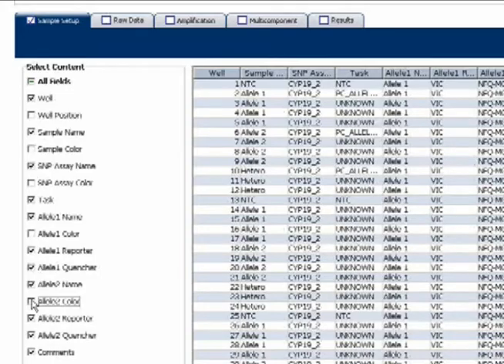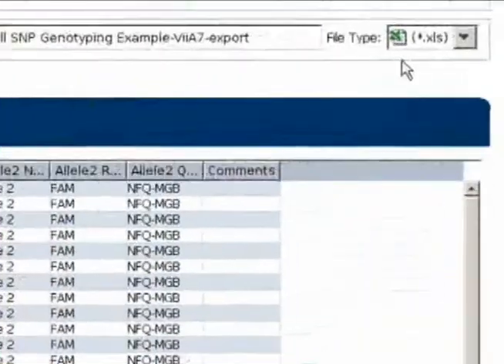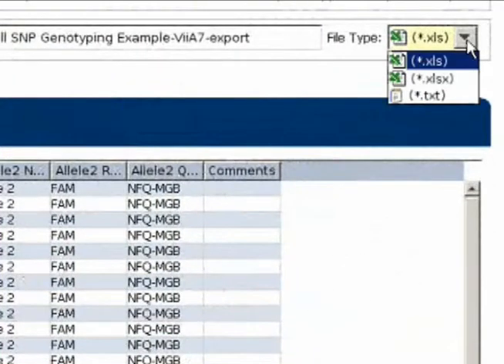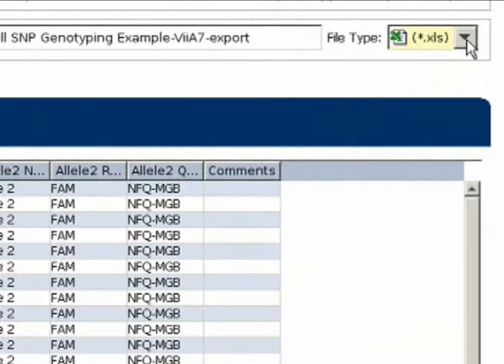With those five boxes deselected, I'm going to go up here and choose the appropriate file type. Remember, once I'm ready to do my import, I have to have either a .csv or .txt file, but not yet. For now, I'm actually going to save this in Excel.